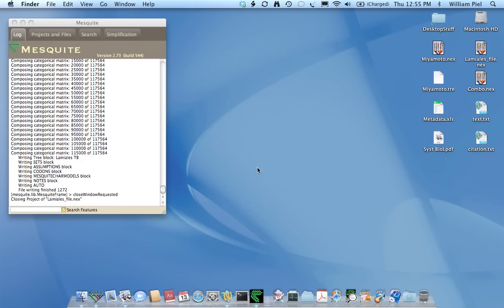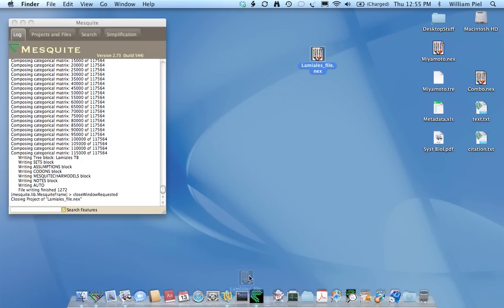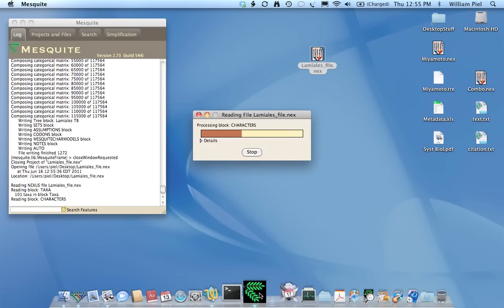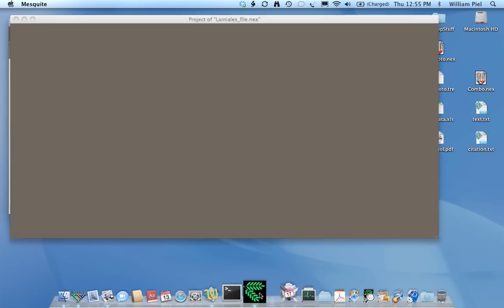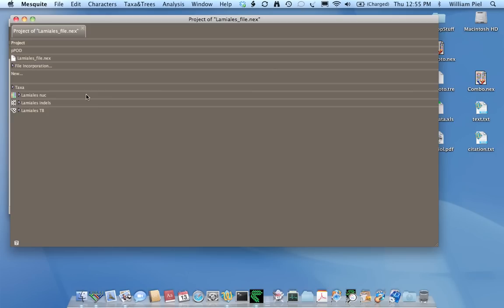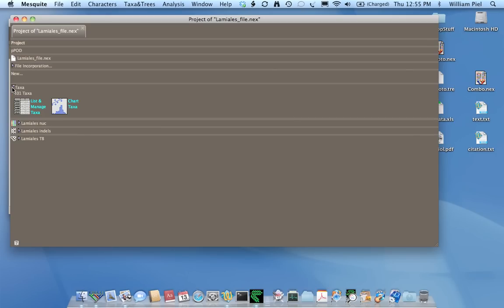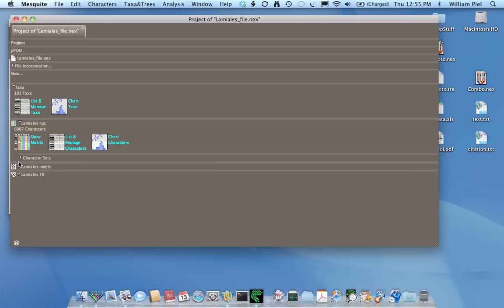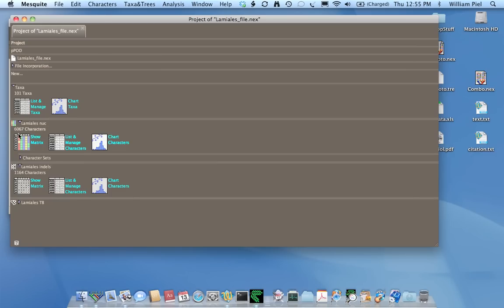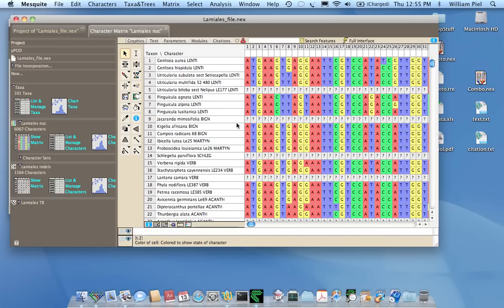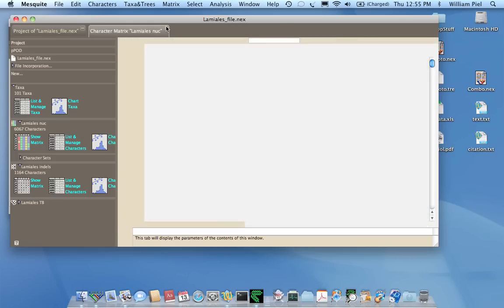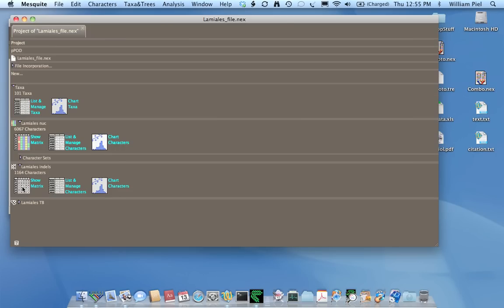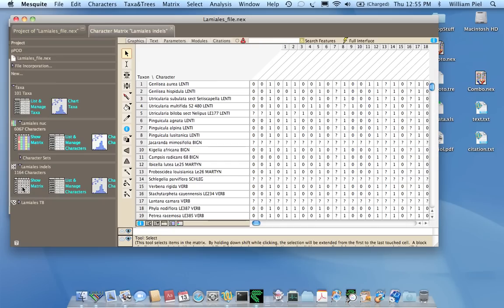In addition, they ensure the integrity of the various components that make up your submission. For example, let's take a look at the parts of this Nexus file in Mesquite. We open it up, and we notice that there's a taxon block here, and inside that taxon block or associated with it are two matrices, some DNA sequences, and some indels which are scored in zeros and ones in this case.